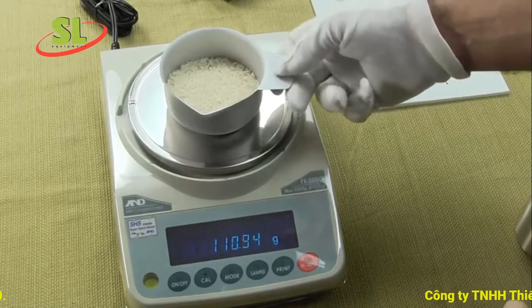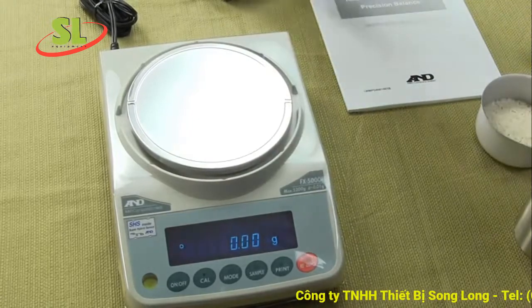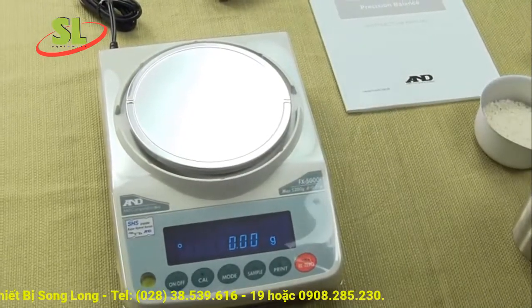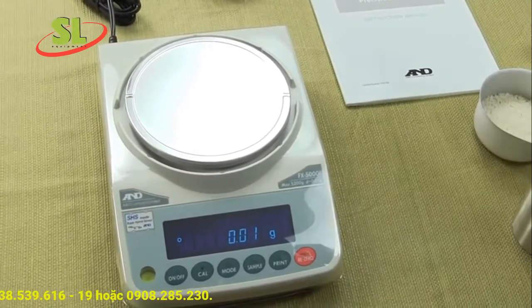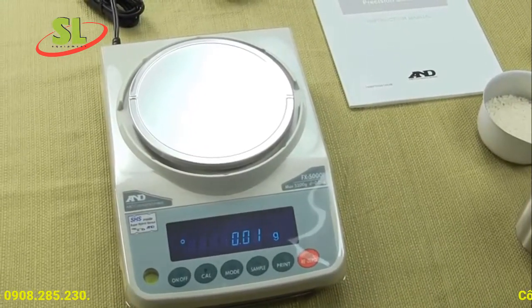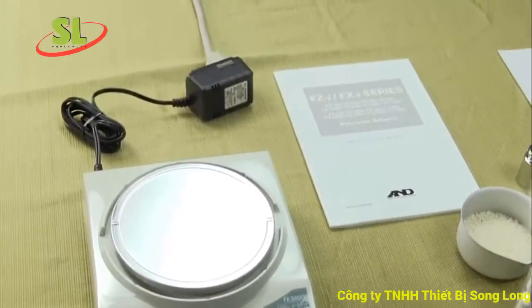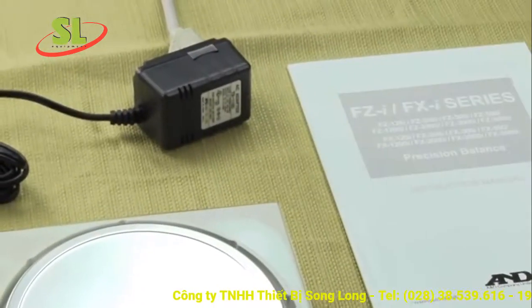The balance comes standard with an AC adapter. This unit can only be run off AC power unless there is an optional battery pack installed. It's fairly expensive, so I would recommend just running the scale off the AC adapter.